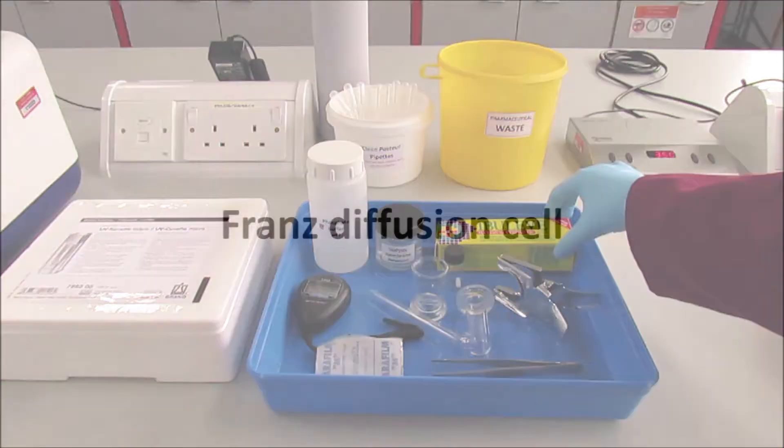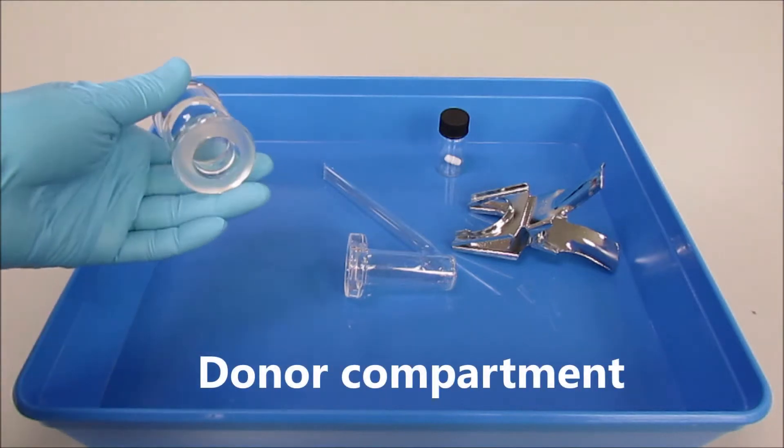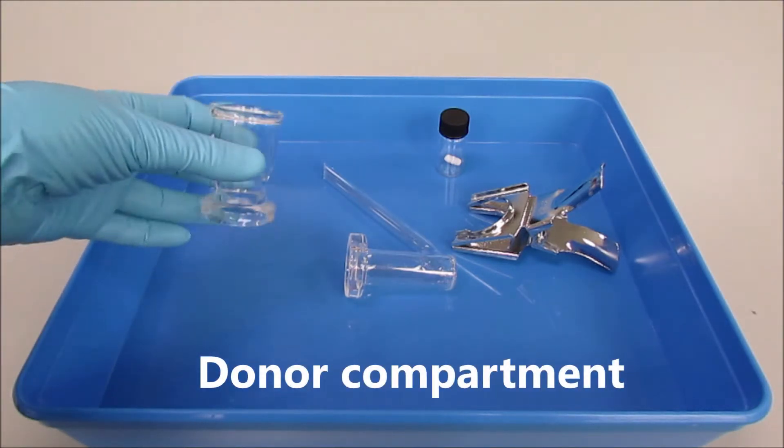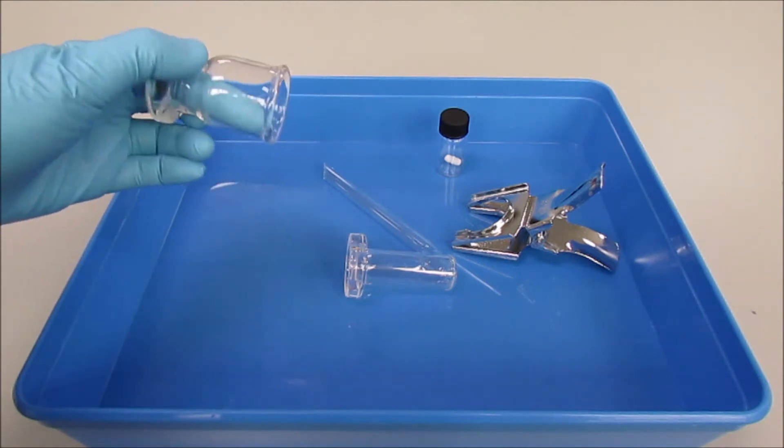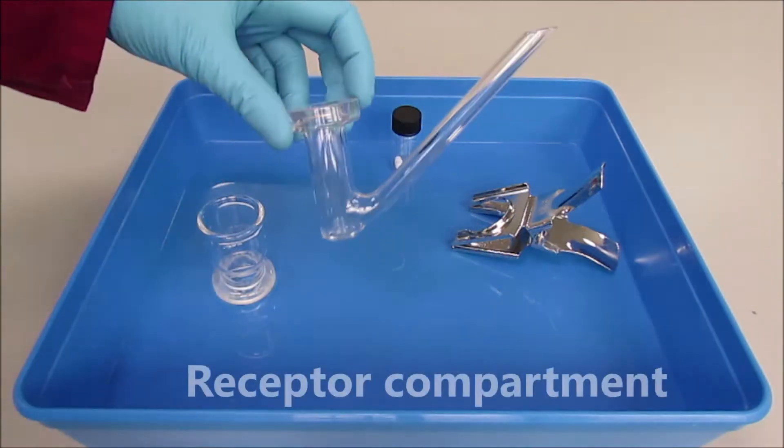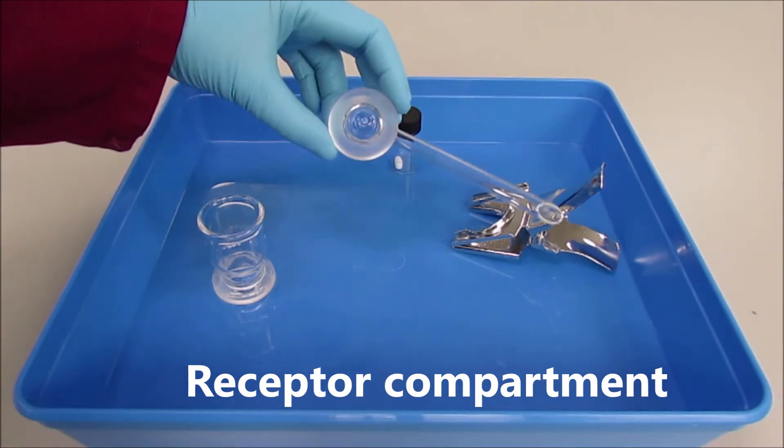We will be looking at ibuprofen transdermal creams and this is how to set up the FRANS cell. The FRANS cell consists of a donor compartment and a receptor compartment, both made of glass.